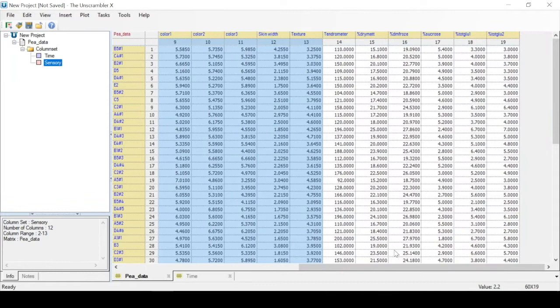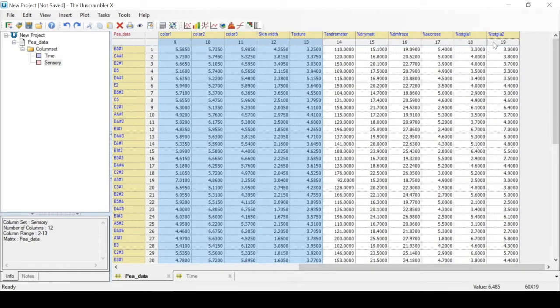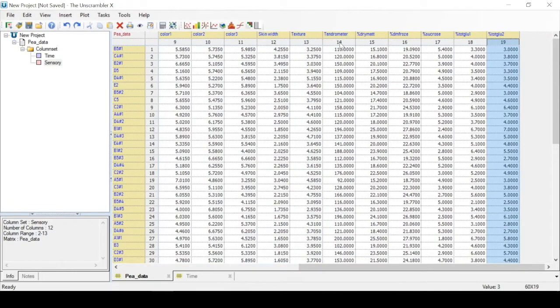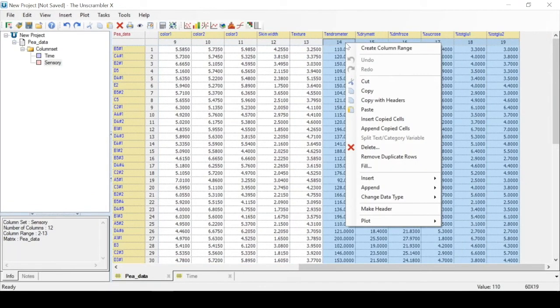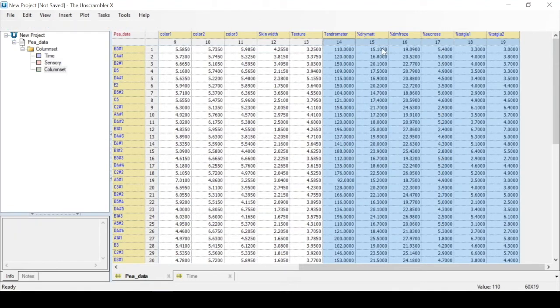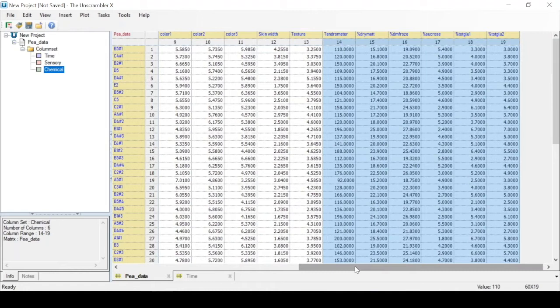At the end of the data table, there are chemical measurements, so we again shift click, highlight the area, and then right click to create a new column range, which we will call chemical.